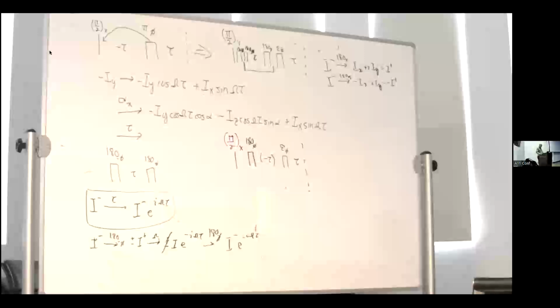All right, any questions? Yeah. There are still no gradient coils in MAS probes for the most part. Right. So it's still doing a 128-step cycle with a solid state. Yes. But your sensitivity also isn't so good. That's true.